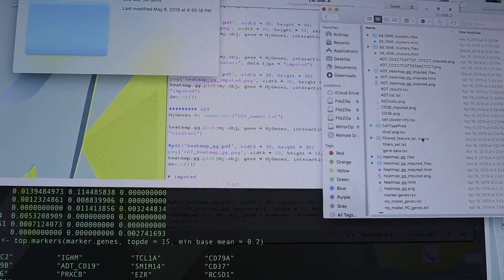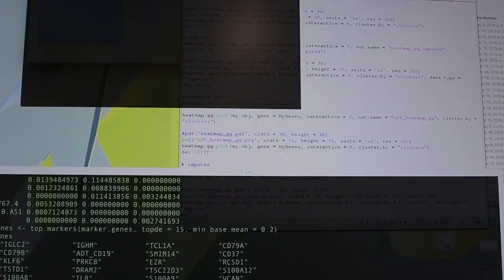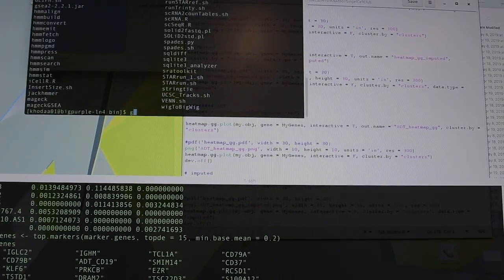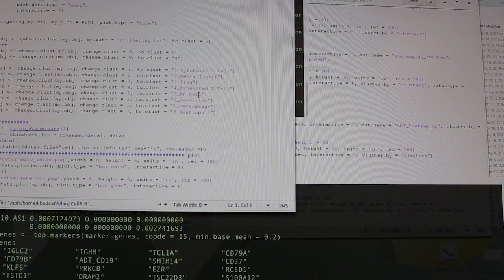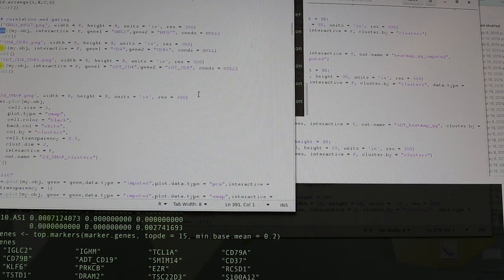Just to continue with this cell gating function, again, it's very intuitive for me because I come from an immunology background. But there are also examples where I've seen the clustering gives you a cluster that seems to be a little bit split, whether on the tSNE plot in particular, or even just for expression of a certain gene you're really interested in. Sometimes you see a gradient across a single cluster.